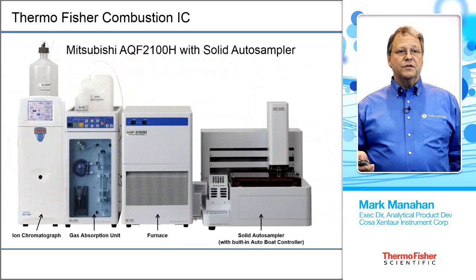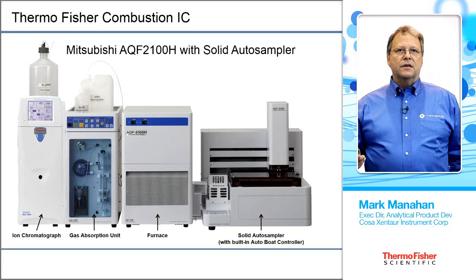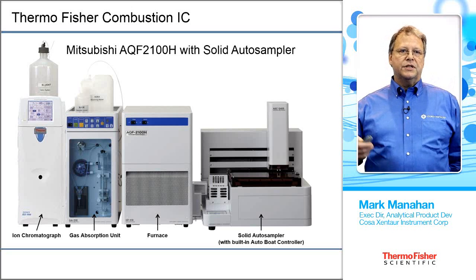Here is the same system, but with our solid auto sampler that has 40 positions, where you would weigh the samples into the boat. Each boat would then be picked up and put into the furnace, burned, the gas is caught, and injected. The beauty of both of these systems is that after the initial burn, each run is the chromatogram time. So it'll be like a 12-minute run, but the first one will be a combination of the combustion, maybe anywhere from 8 to 12 minutes, plus the IC run.